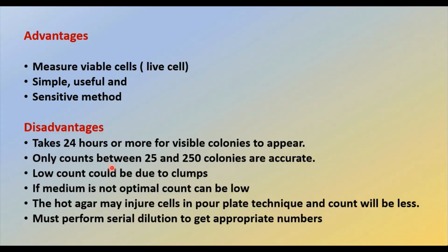Then coming to the advantages and the disadvantages of the pour plate method. We measure the viable cells by using this method, and this method is very simple, useful and even a sensitive method.